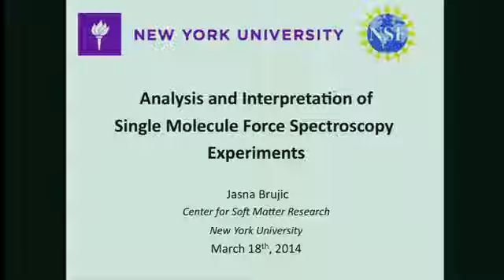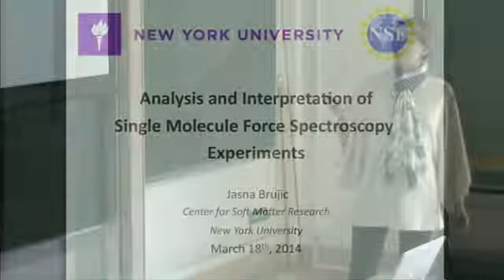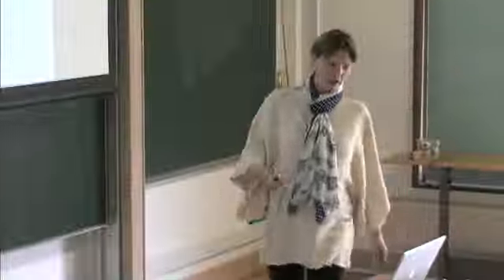Yes, so I think I'm going to be a little bit of an odd one out here because I'm going to be showing you lots of data, and I'm an experimental physicist. So I'll try to show you how maximum likelihood algorithms and novel analysis techniques can help with a specific case study of looking at what the force spectroscopy of proteins can tell us about protein folding.